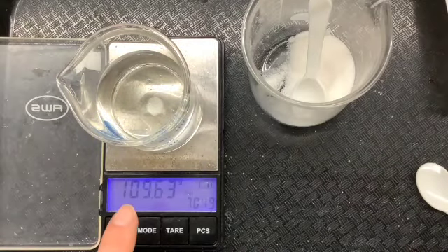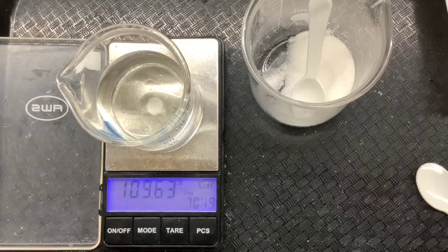So what do you think could have caused the error? Well, I know that these scales aren't super accurate, so maybe it could have been the scale. Maybe it could have been some sort of calculation I did. But why don't you fill in whether your experiment followed the law of conservation of mass?